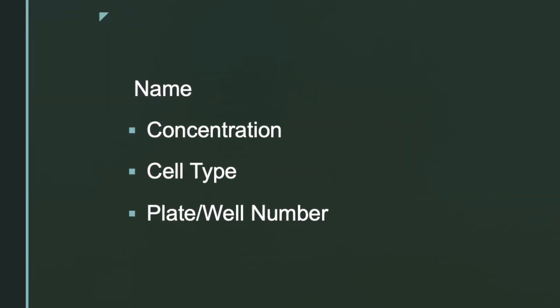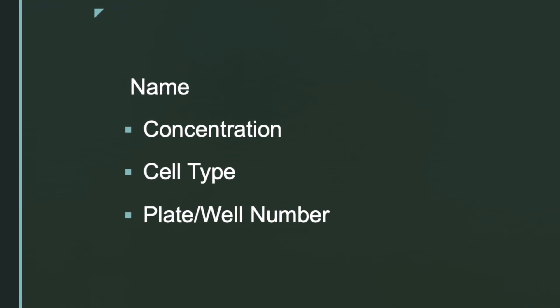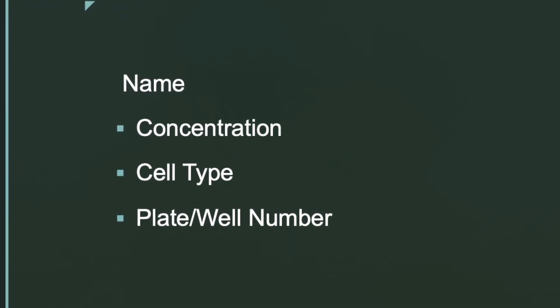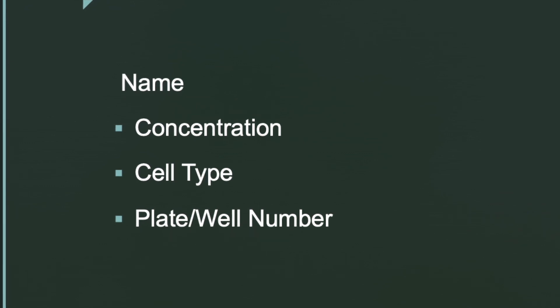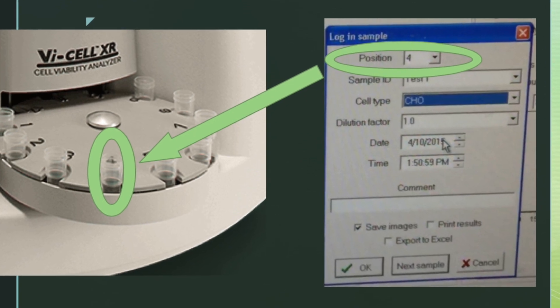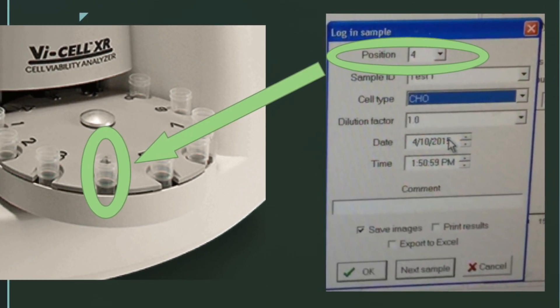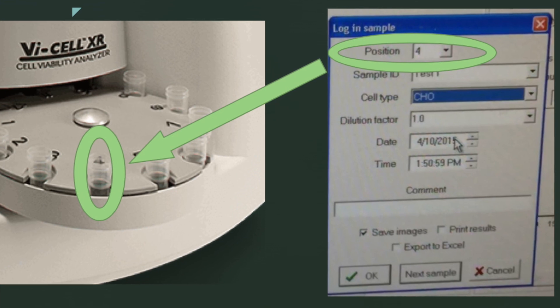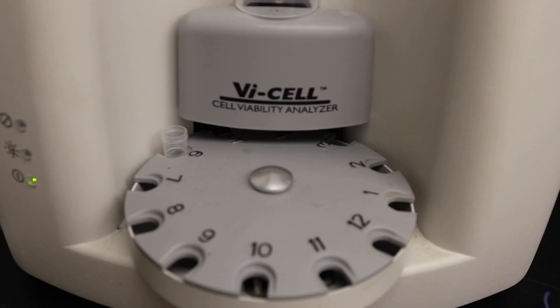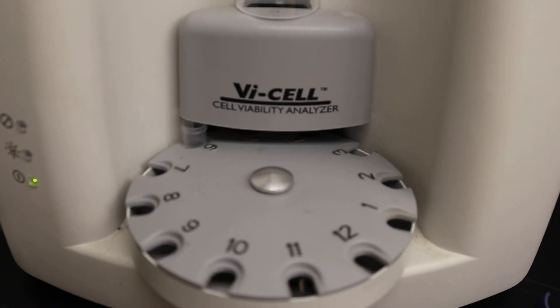Make sure that each cell name is unique; otherwise the program will overwrite previously stored data and may interfere with your results. Make sure the number on the rotator wheel corresponds with the position number logged for the sample, and do not manually move the spinner to add more cell samples as this can cause problems with the machine.